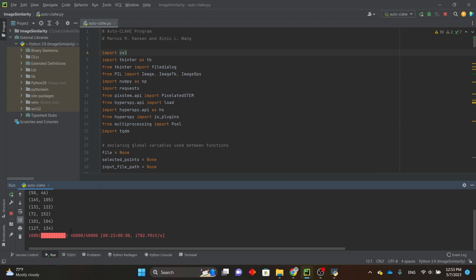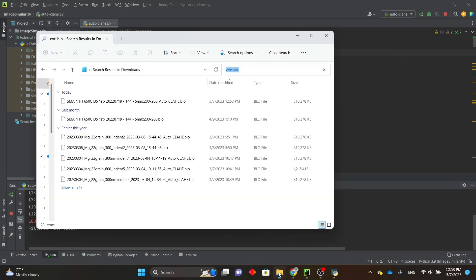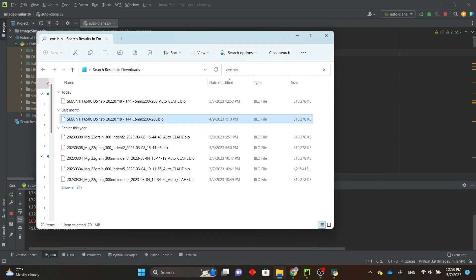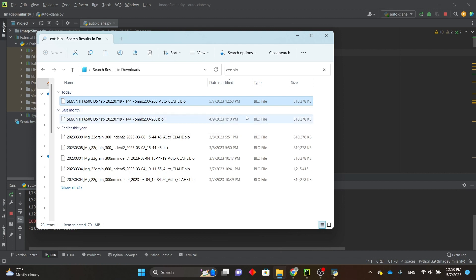So now it's saved. And you can see here, this is my original file, and this is the filtered file with Auto CLAHE at the end.